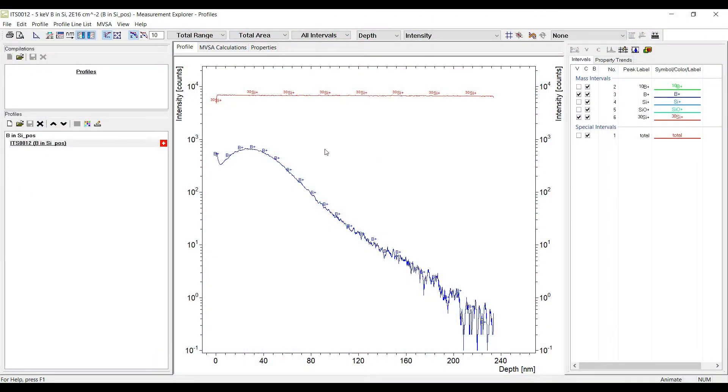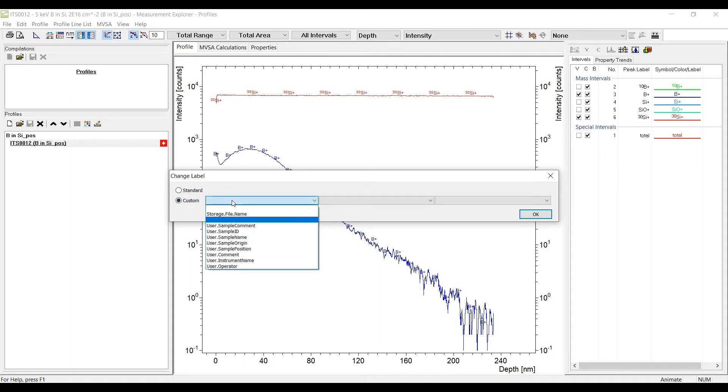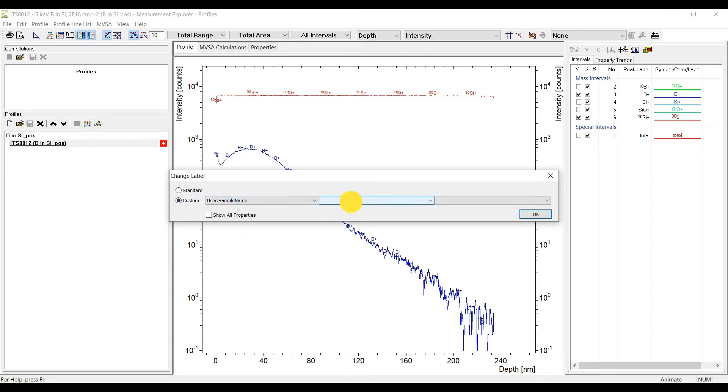In the data list the analysis can be labelled with other properties like the sample name or sample ID and not only with the given file name. The user entries are available in a quick access drop down menu.